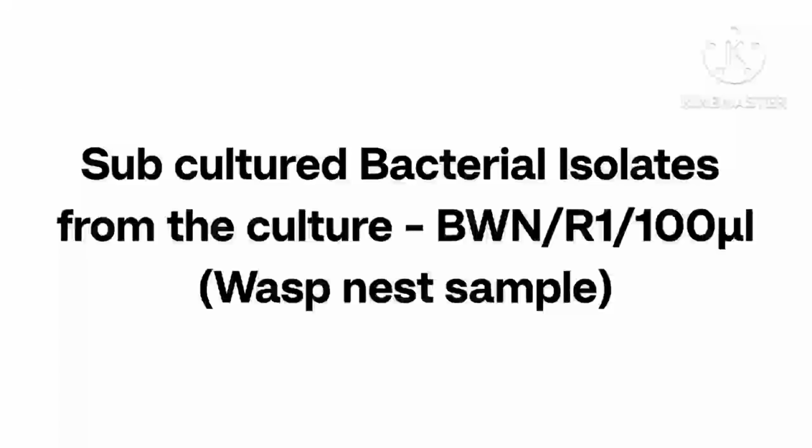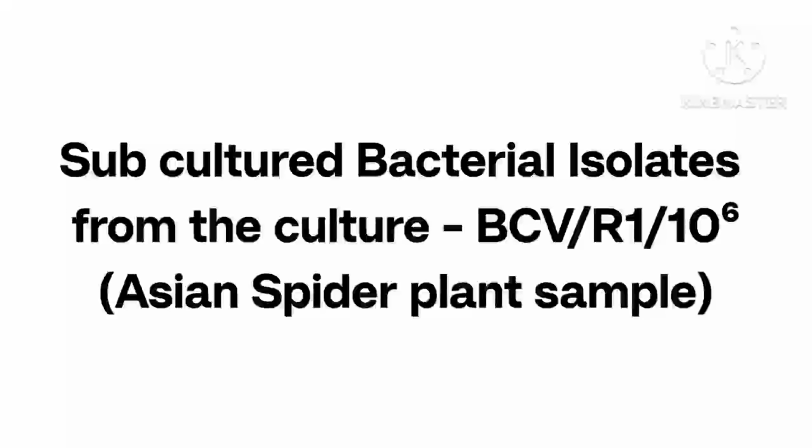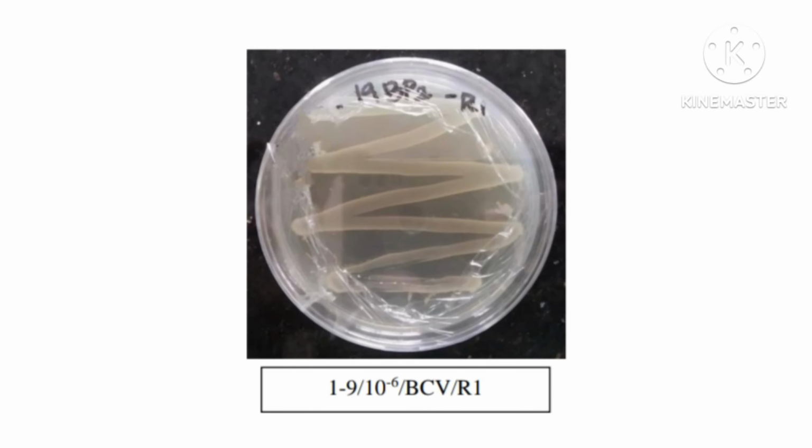Subcultured bacterial isolates from wasp nest sample. Subcultured bacterial isolates from replication 1 under 100 microliter dilution. Subcultured bacterial isolate from Asian spider plant sample. Subcultured bacterial isolate from replication 1 under 10 power 6 dilution.